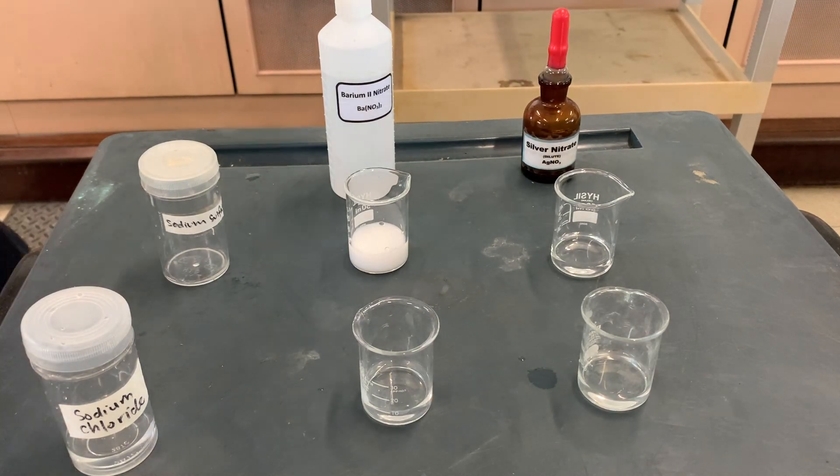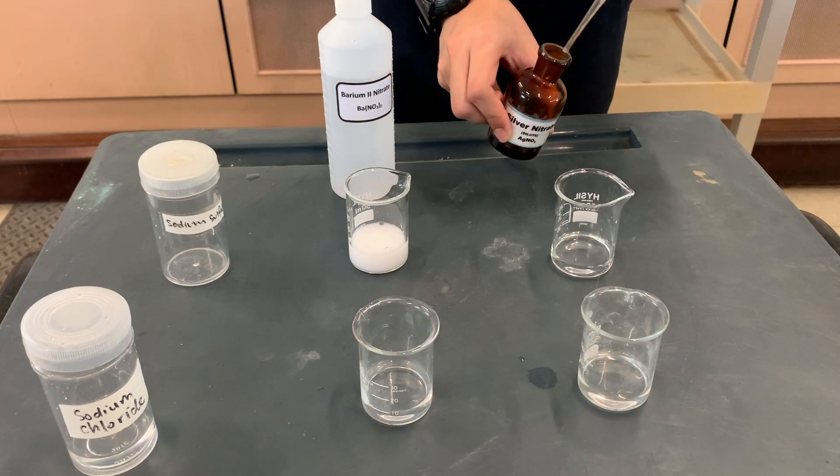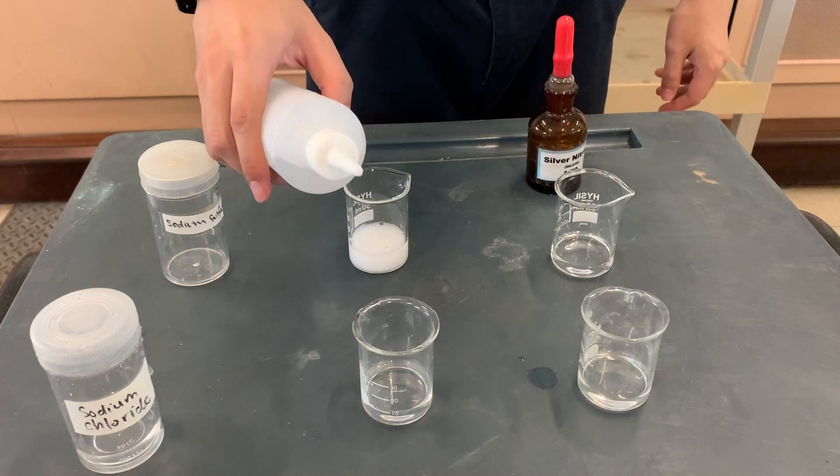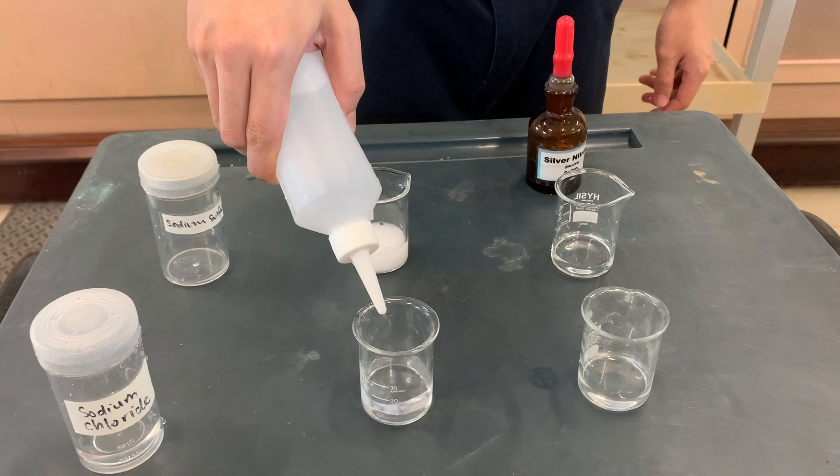Do you think we observe the same thing? When we add silver nitrate to sodium sulfate, no precipitate is formed, there is no observable change. If we add barium nitrate to sodium chloride, there is also no visible reaction.